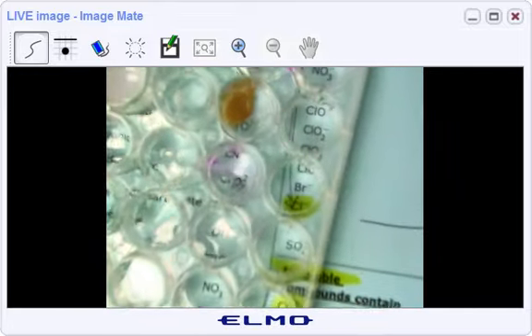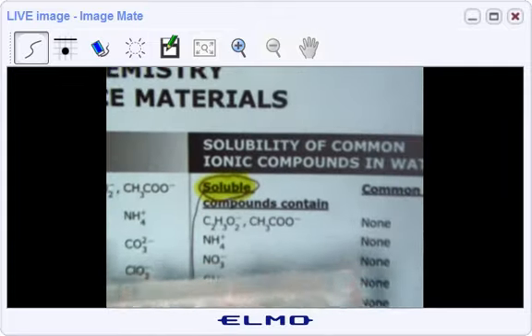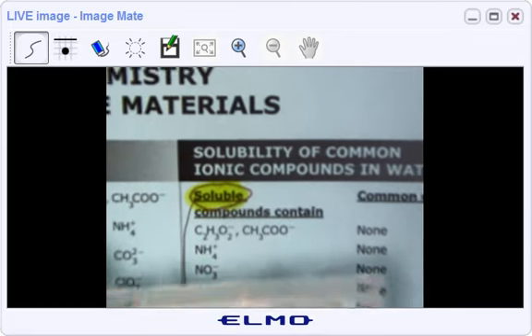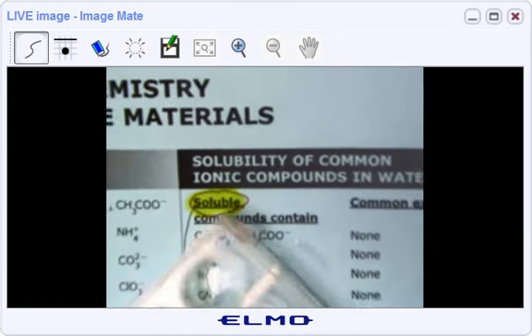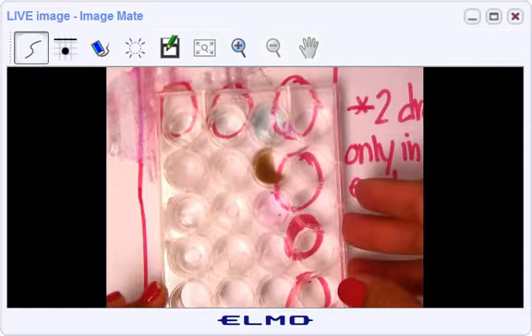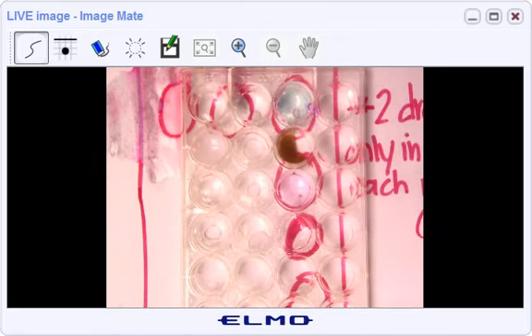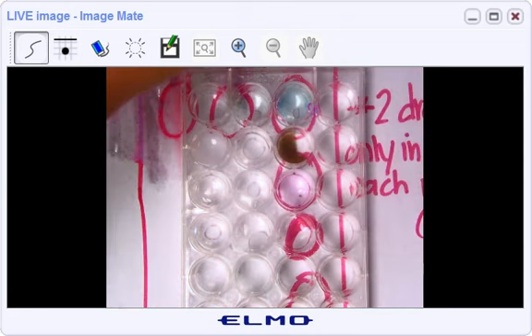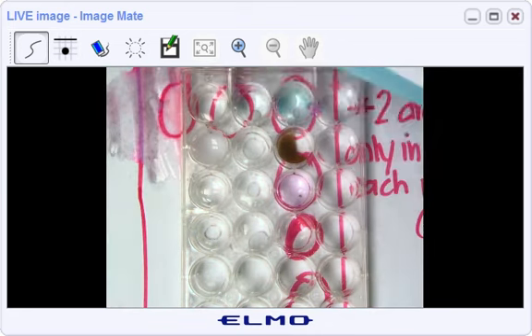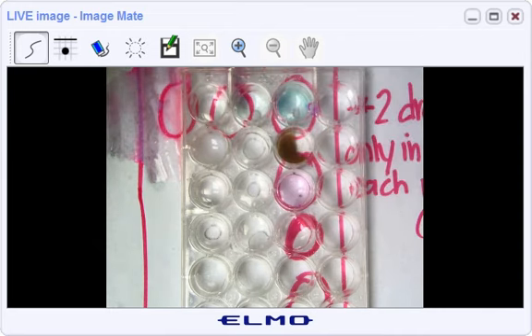Okay. Now then, what is the same with the cations? They all have Na. And then with number 3, read that. When you combine the liquids that had both 1 and 2 in them, when you combine those two, were they soluble or insoluble? When you put the sodium with the NO3, look at it. Look at your chart. They stayed clear. So, were they soluble or insoluble? Soluble.